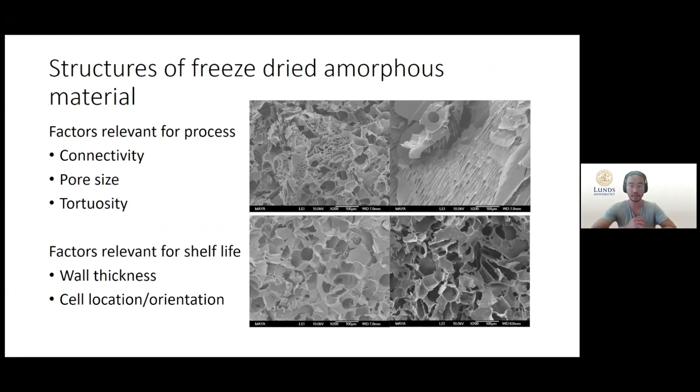So these are some pictures of freeze-dried material, of amorphous material. In this instance it's maltodextrin. We can clearly see that there is a difference between the structures but it's not easy to draw any conclusions on pore size or wall thickness and this is of course the reason we need X-ray tomography. I will go into details on what kind of structures we see in these features later on.